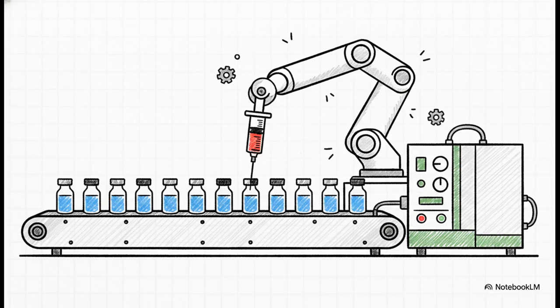The single reference solution has to be periodically re-injected just to compensate for natural baseline drifts. The instrument's mechanical tuning absolutely cannot vary between runs, and above all else, there must be unfailing reproducibility in those injection volumes. If the machine accidentally injects even a tiny fraction of a microdrop more for the sample than it did for the standard, our entire mathematical ratio completely falls apart.